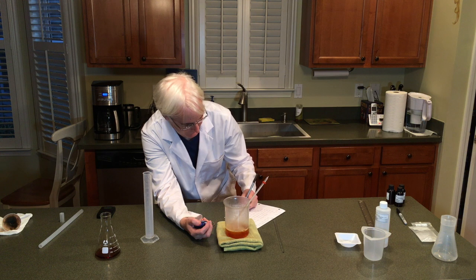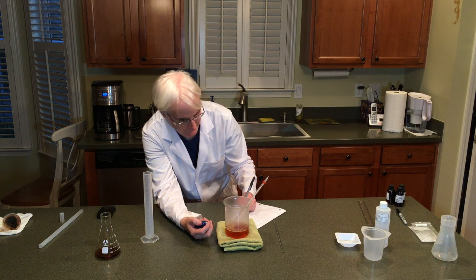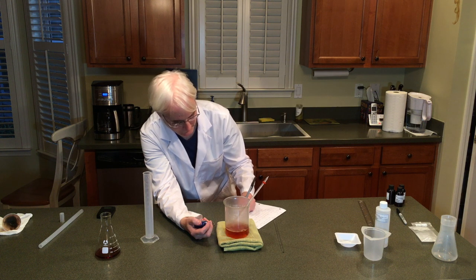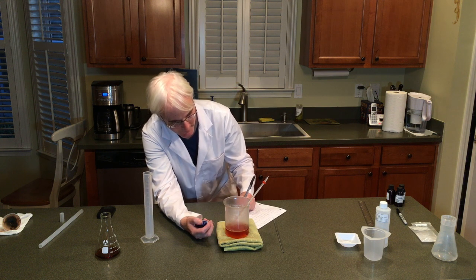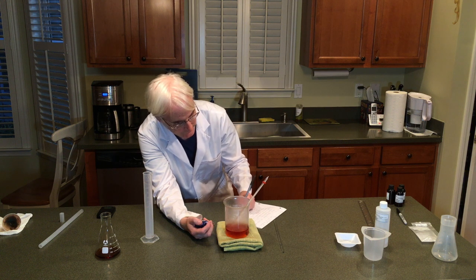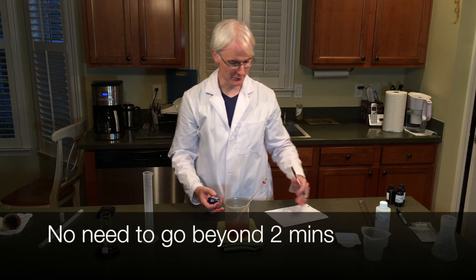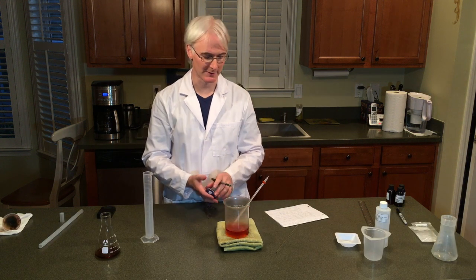And 80, and 90, a minute and a half — you're watching the color change also, don't forget about that. 1 minute 50, 2 minutes, and you just keep going. Now you're going to chart the color change and the temperature for each of those 10-second increments.